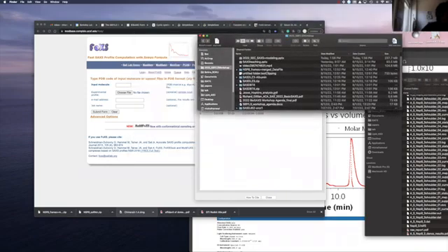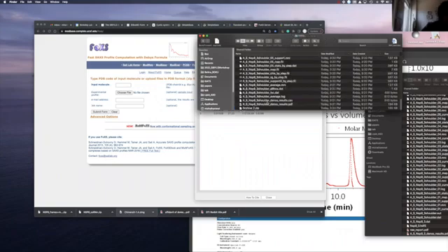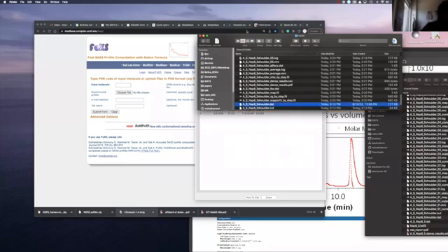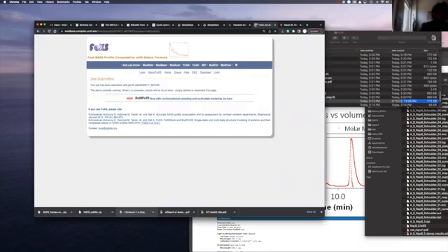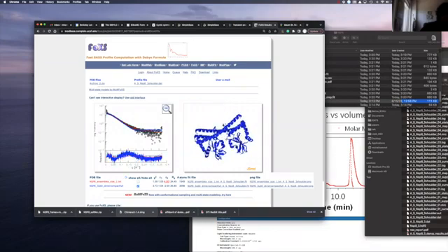Okay, here it is. Shoulder, shoulder dat, and shoulder out. Here we go. That's my dat file for the shoulder, and I can take that to the experiment. When you click submit, you will directly have a fit for those 2 files. One is the monomer and the second is the dimer. The dimer is from the crystal structure of a homolog. It's not exactly the same as the COVID-19 NSP8, but it's a very similar coronavirus.